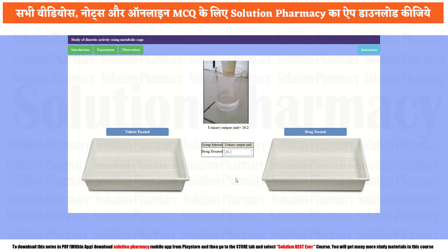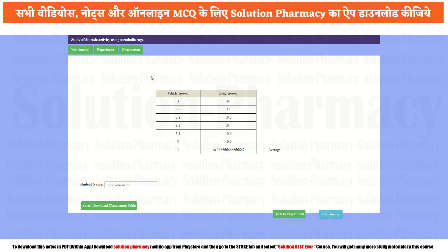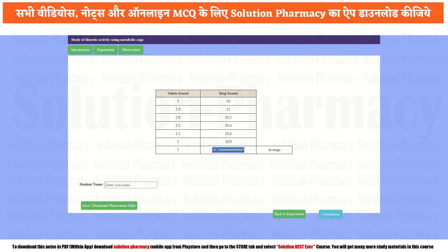Now click on the observation table to see how much urine was produced by each experimental group. The vehicle treated group cumulatively excreted an average of 3 ml of urine, whereas the drug treated group excreted an average of 10.5 ml of urine. There is a large difference between the two groups, indicating the given drug has significant diuretic activity.